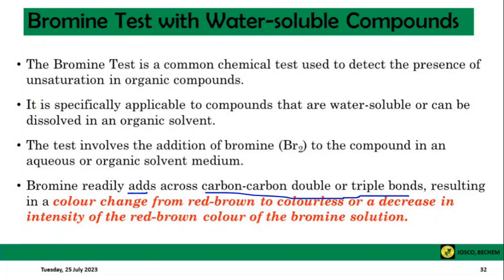What are we expecting to see? We are expecting decolorization. Decolorization from which color to what? The color is going to change from reddish brown to colorless, or you would see the color go from a deep red-brown to one that is lighter.